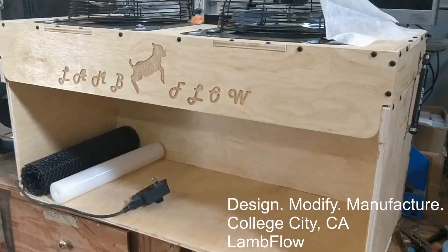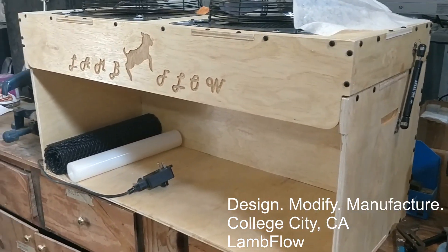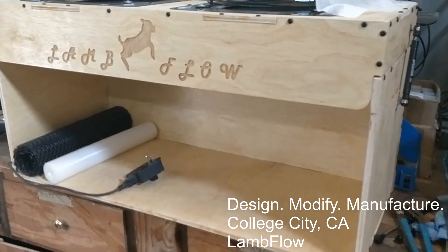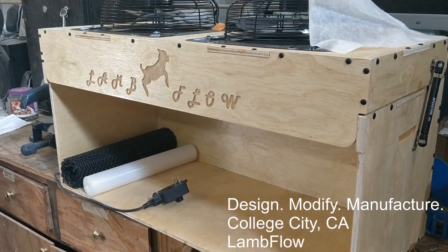This is a laminar flow hood. I designed and built these out of wood. You get much more cost effectiveness out of this and much more volume than the pretty high-priced metal ones or plexiglass ones.